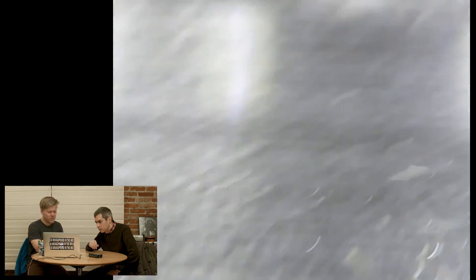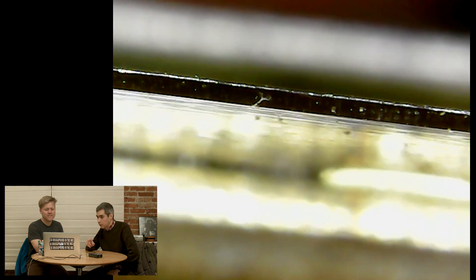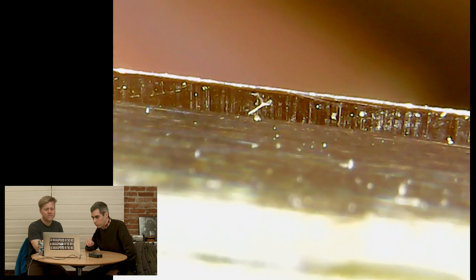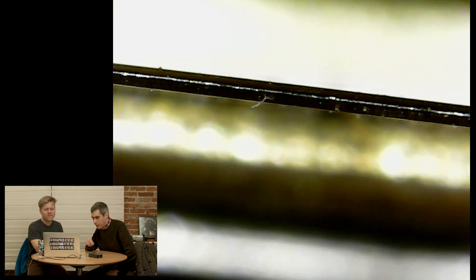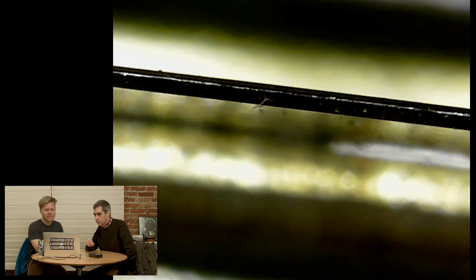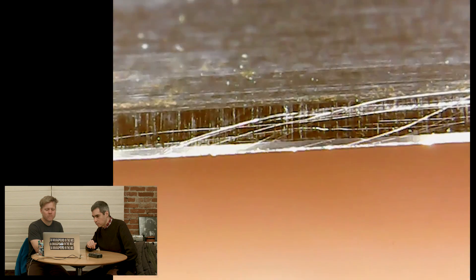It's hard because the light is shining on it. Whoa, wow — that's neat, actually. That's cool. Get more vertical with it. So we're seeing the edge. Look at how it gets to this sort of fine point. There's the blade — there's the edge that's doing the damage. It's a thicker piece of metal, and then at the top it kind of converges. There's the shine on the slope, and then at the tip it comes in for that hard edge that really does the cutting, that slices through. Look at that — that's a slice right there.